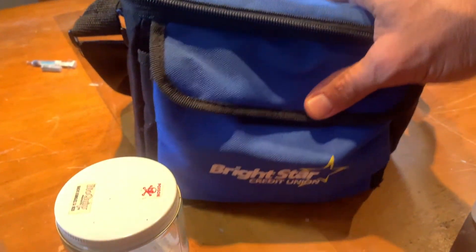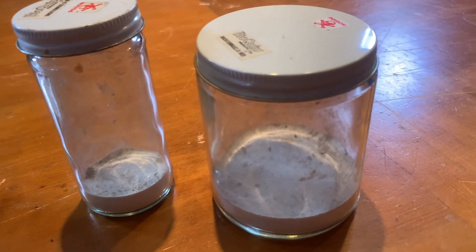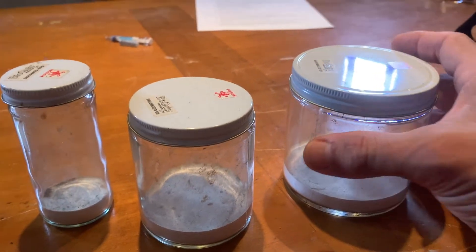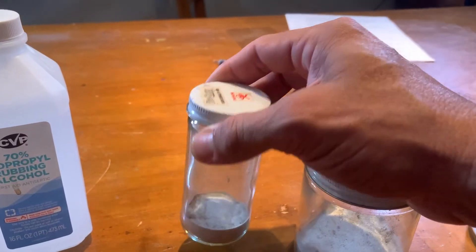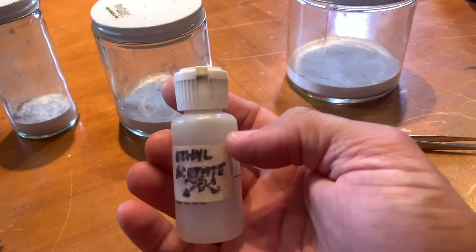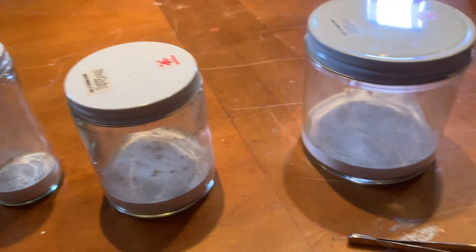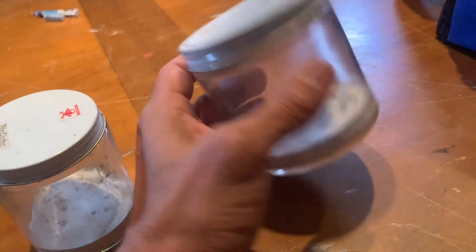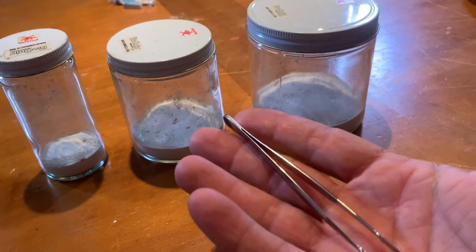If the jar is properly charged with the right amount of ethyl acetate, specimens go out very quickly — a second or two and they're gone, very humane. When collecting insects at a light sheet, we use a dump jar and smaller jars to collect specimens. Once they've gone, we dump them into the large dump jar and keep them there until we get back to our house or hotel, then use forceps to put them into envelopes.